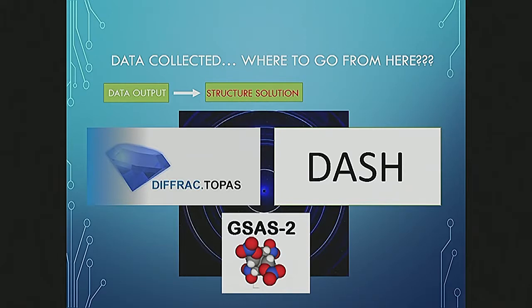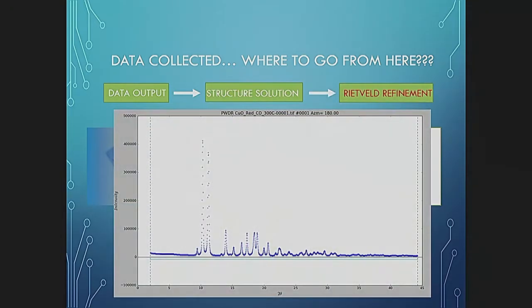the refinement. So I've listed here a couple of the software systems that you could use to do the structural refinement or structural solution. But today we're just going to talk about Rietveld refinement, which is the refinement of the model that you get from the structure solution.